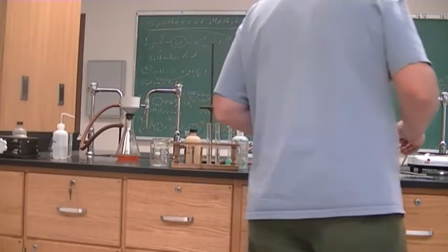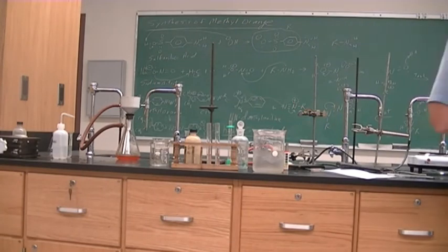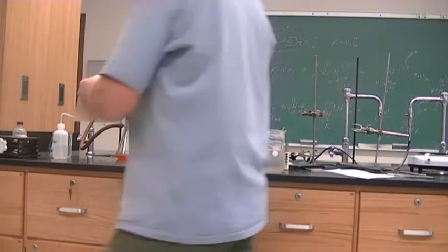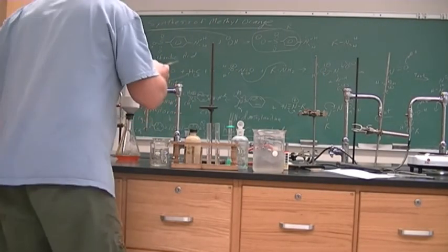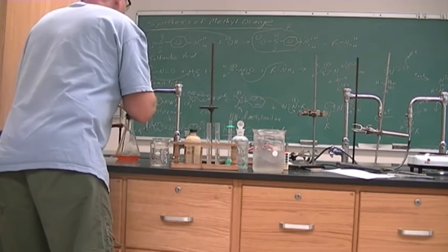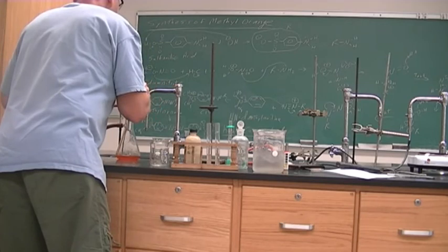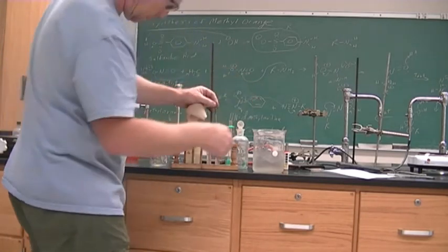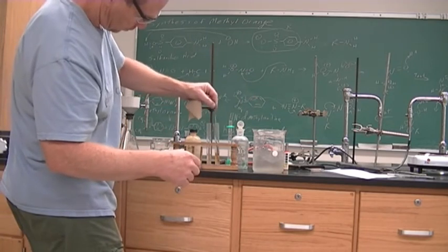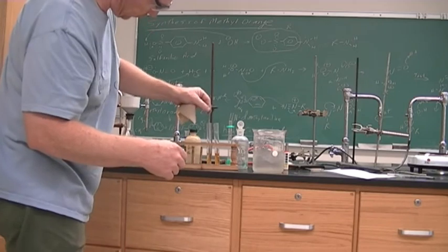All right, so I'm going to get a little bit of that out. There, put some in here.